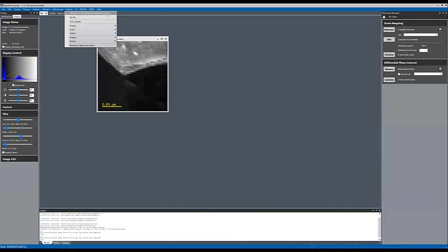And when you want to do data processing, depending on what you're doing, if you need access first to the diffraction dimensions or first to the spatial dimensions, one or the other could be faster. So you have the option to rotate or reorder the data under the volume menu as well.